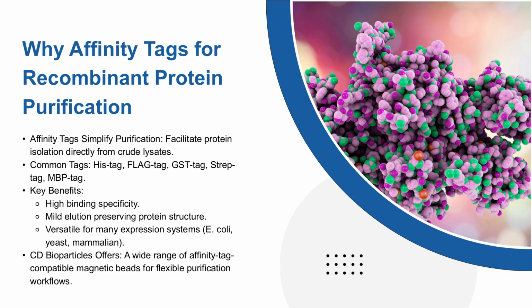This highly specific interaction allows researchers to isolate the target protein directly from complex biological mixtures like cell lysates, with minimal background and high purity. This approach not only simplifies the workflow, but also preserves the biological activity of the protein, which is critical for downstream applications in structural biology, drug discovery, or therapeutic development.